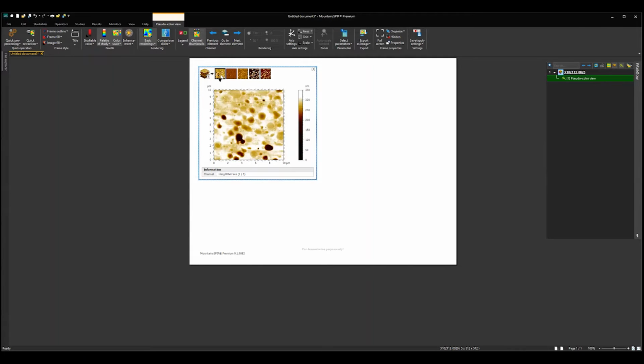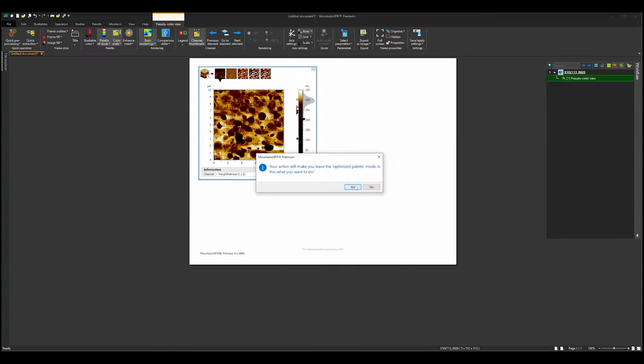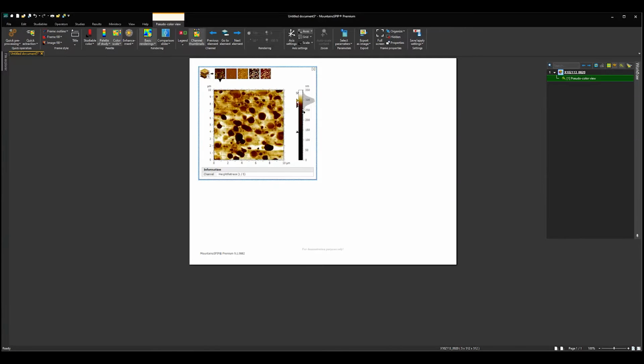Another really important tool, I'm actually going to have the software optimize this. Another really important tool is cross-sectional profiles. We need cross-sectional profiles in order to measure lateral and vertical distances in our image. So I'm actually, let's see if I can, yeah, that's a little bit better. The optimization was a little bit too aggressive.